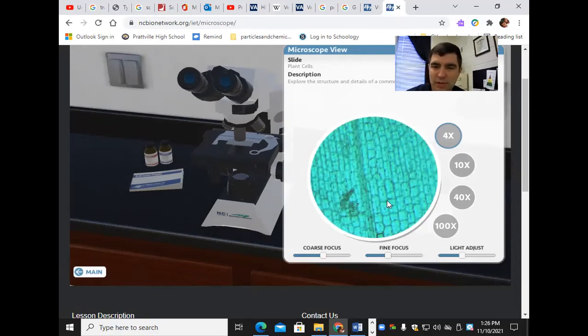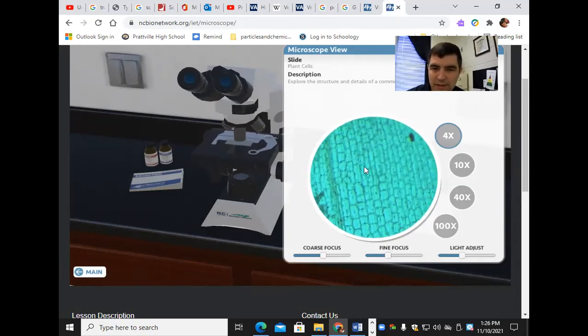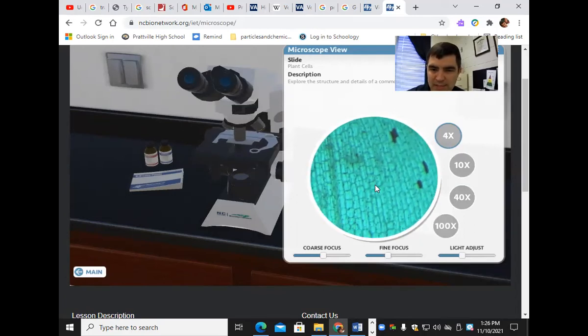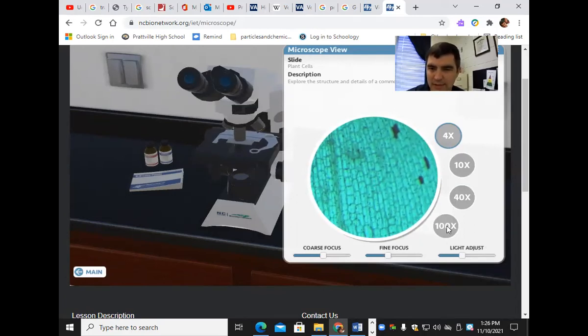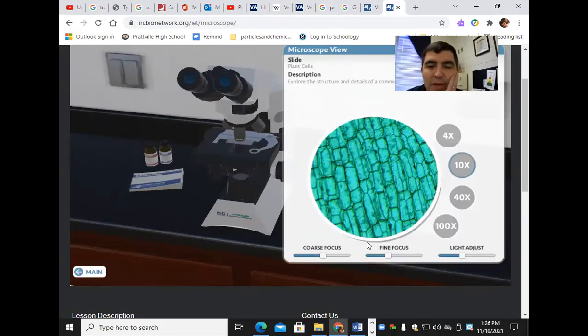I can move it around to where I want to look. I want this in the center — I want to see what this looks like right here. Then I click on 10x. When I get to 10x, I get a little bit more magnification and you can see those cell walls really clearly. I can sharpen my focus and change the light.